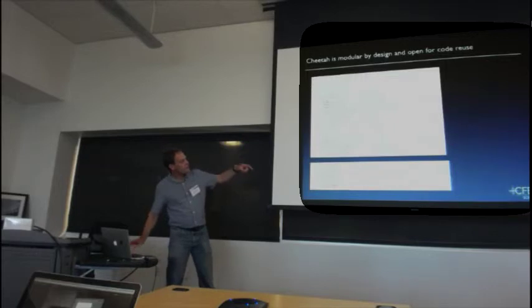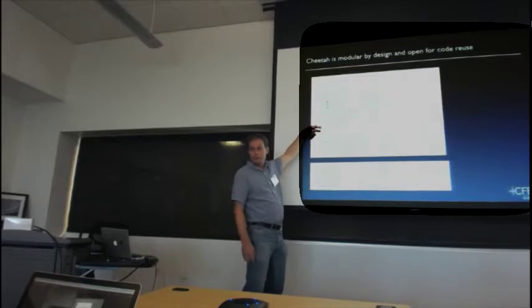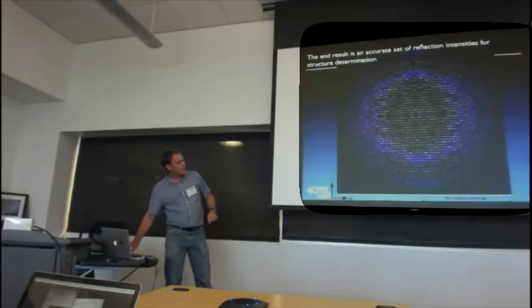All of the functions in there, for those who want to program, they're just simple little functions that you could call on their own if you wanted to. There's Python wrappers if you wanted to do that. But don't worry, it's all pre-installed at LCLS, and we'll get into more of that.